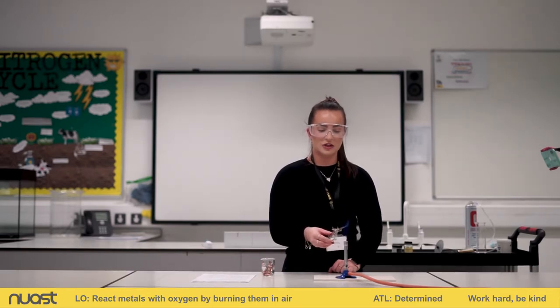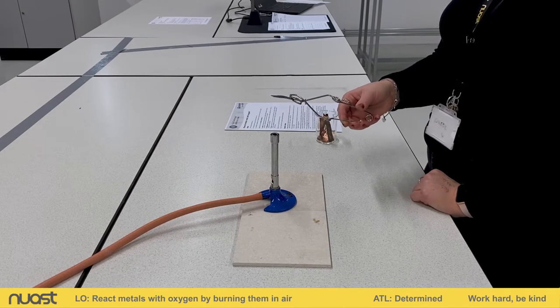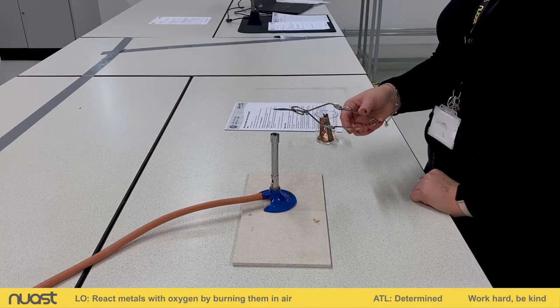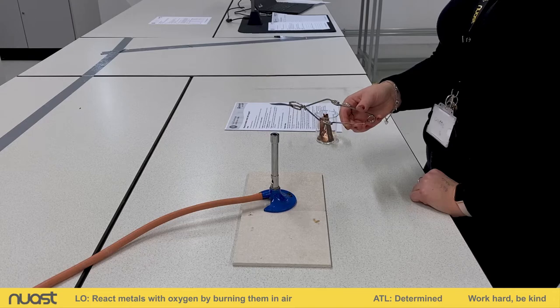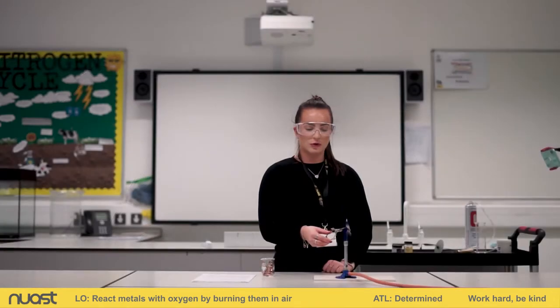Okay, so I can see a slight change of colour, and I can see that the outside of the copper is changing colour to more like a grey black colour. I'll leave it in for a bit longer and then I'll hold it up to the camera for you. Now make sure you've made your prediction about what the product is going to be made here.